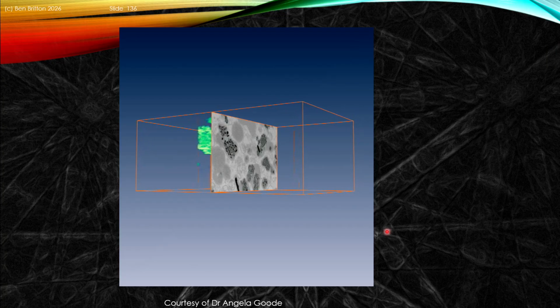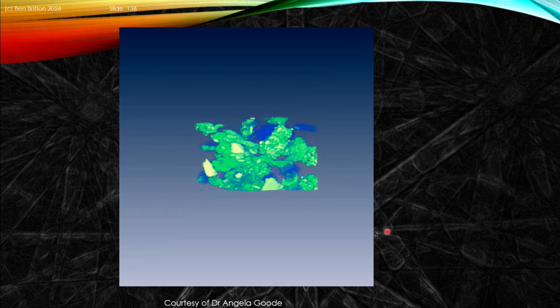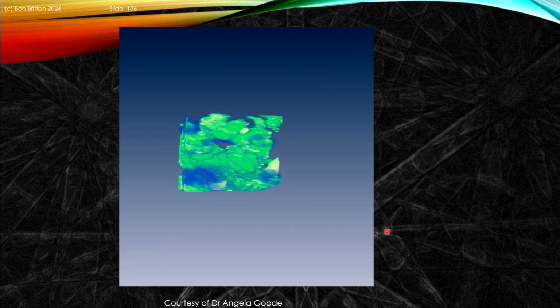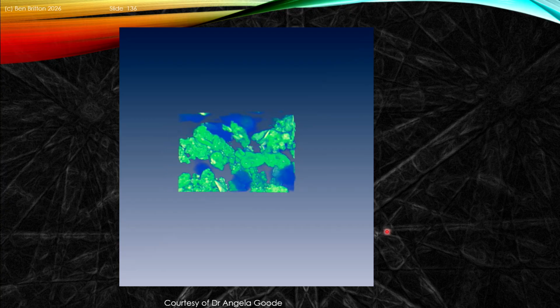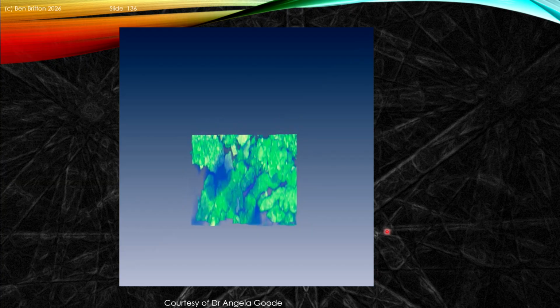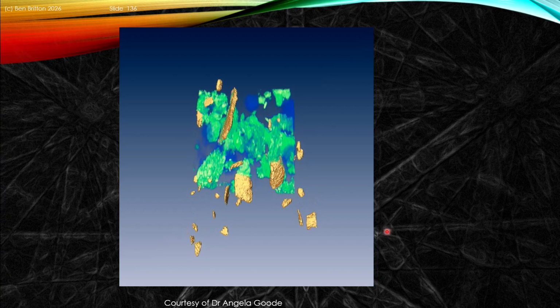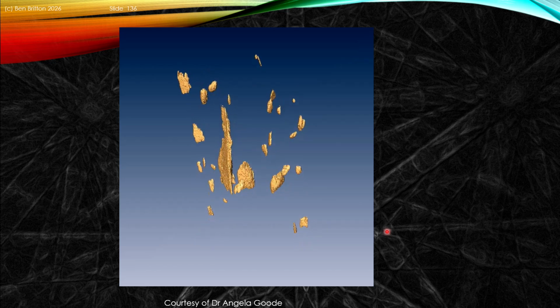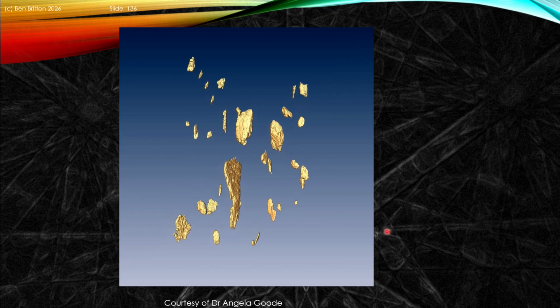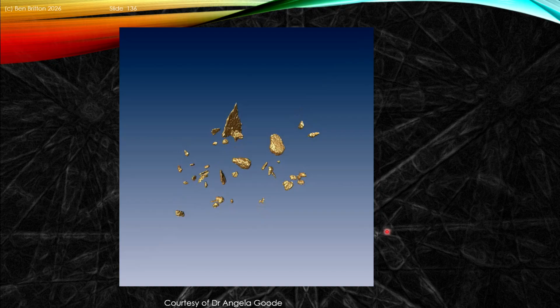So we can see those slices, and then Angela did some very nice segmentation to pull out a particular phase that then enables us to get this 3-dimensional tomograph that then can be rotated to reveal the structure that's presented in this micrograph. And so that starts to be quite powerful once the data has been properly segmented. And we can effectively look at it across different angles, and we can of course slice through and make several virtual cuts to look at the structure. We can label alternate phases and how they intersect with that microstructure, and so that again becomes very powerful to look at 3-dimensional objects, for instance their spacing, aspect ratio, size, shape, interfaces, connectivity, etc. in this.